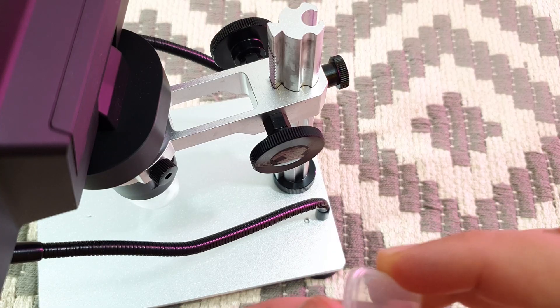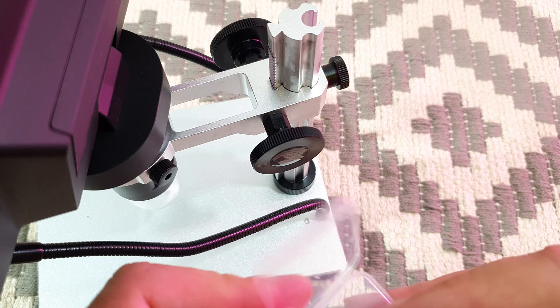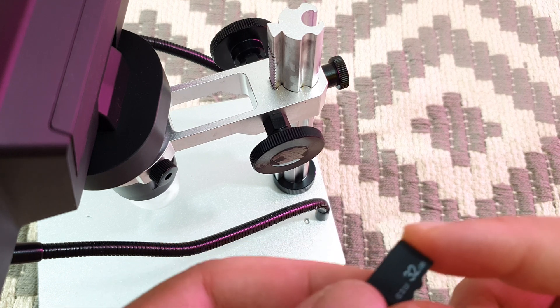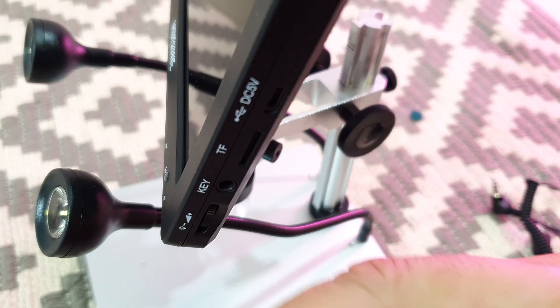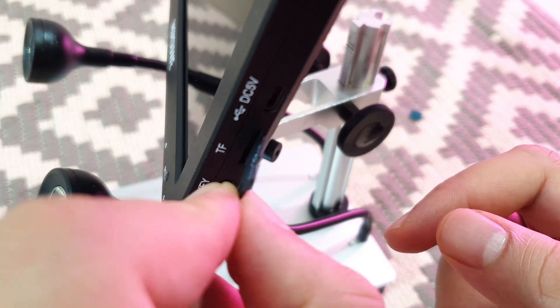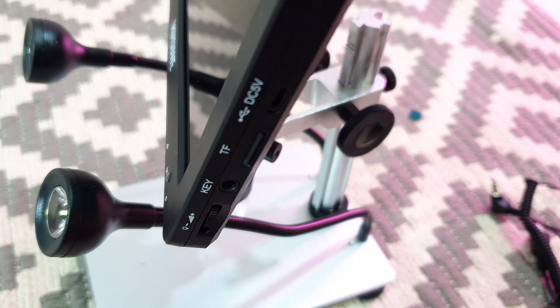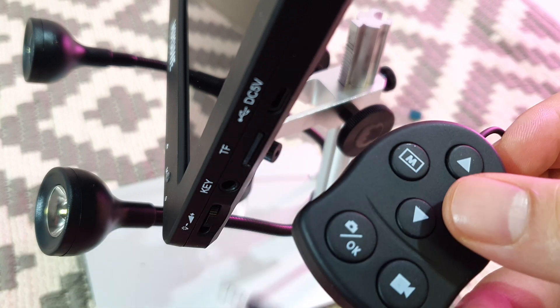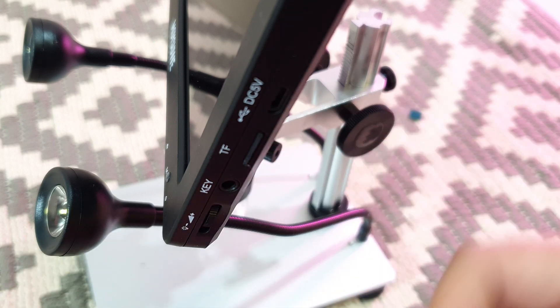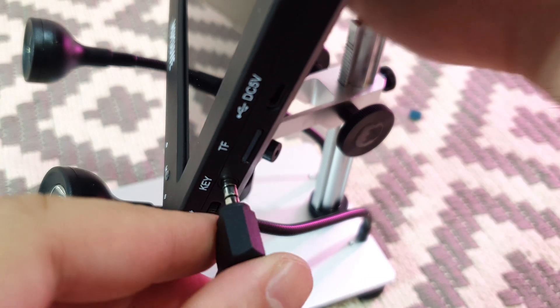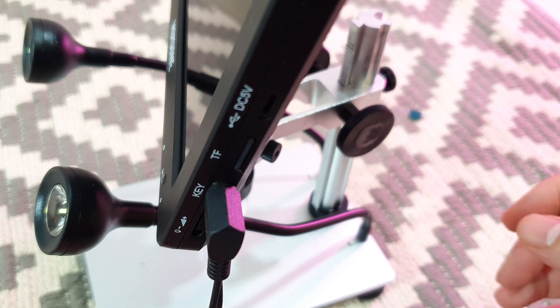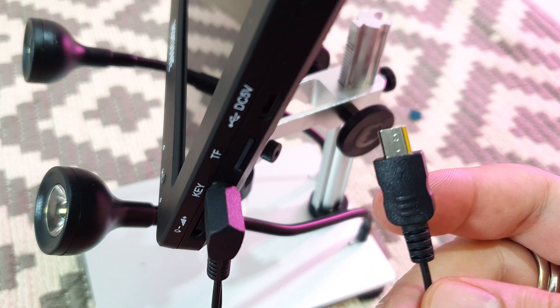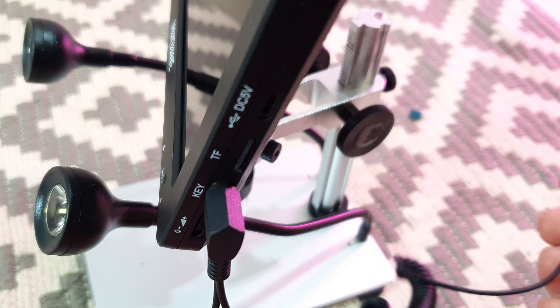I'm going to add the memory card which I've offered. There's no branding on it, it just says 32GB. I don't even know what class this is, but let's have this inserted in the slot. This is the remote control unit, it's got this 3.5mm jack which I think it uses to control. Let's plug this 3.5mm jack here. Now the micro USB cord which comes along with the remote is supposed to go to the base plate. Do not plug this in here because it will not power up the device.